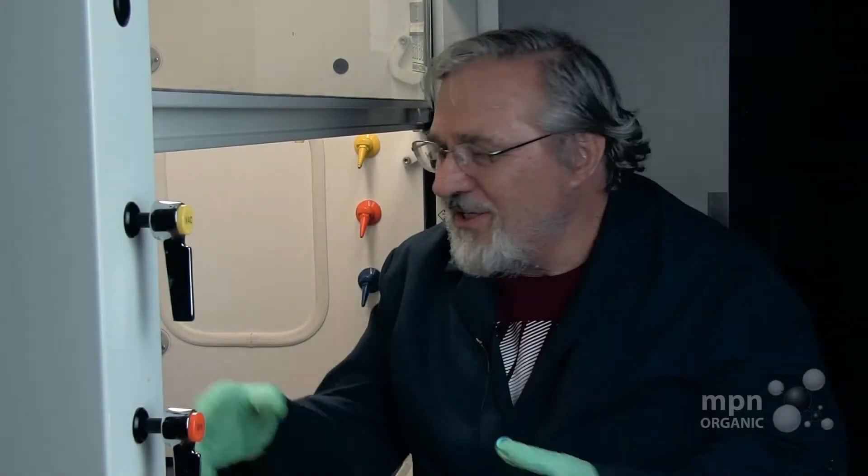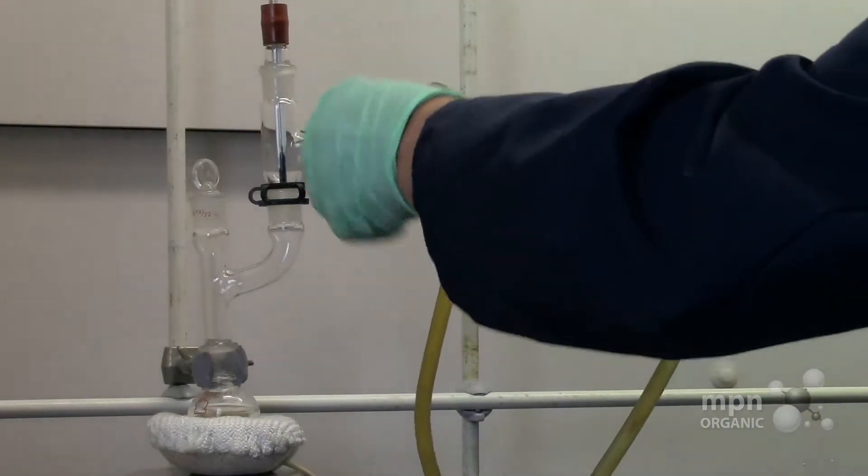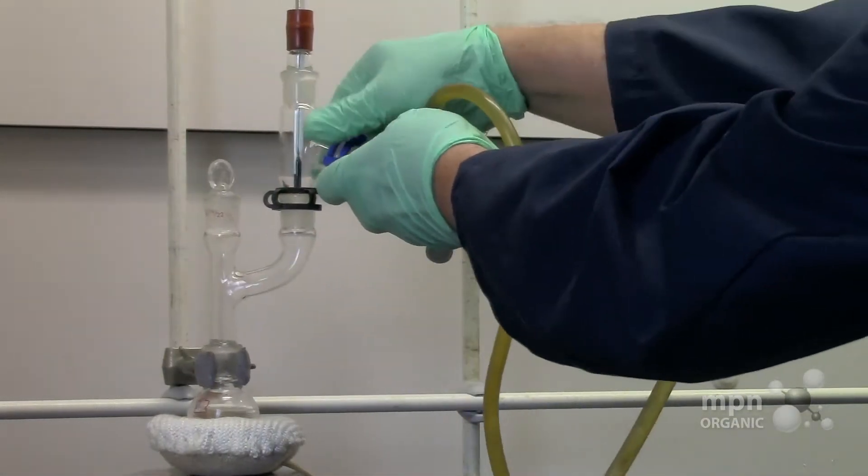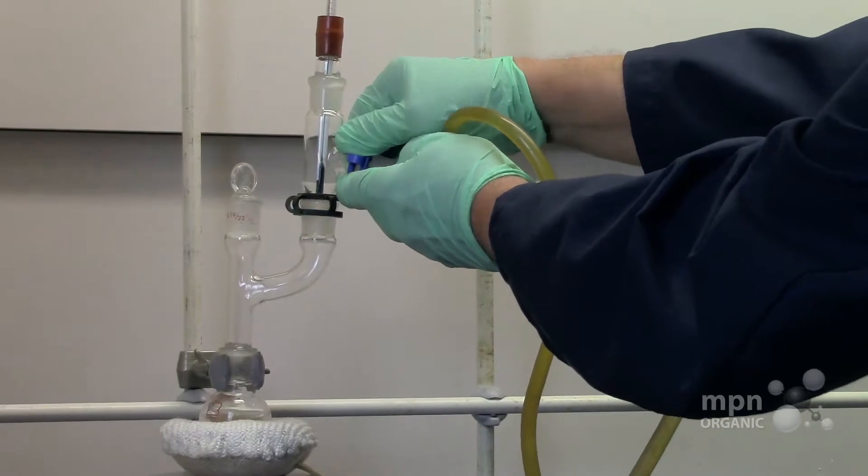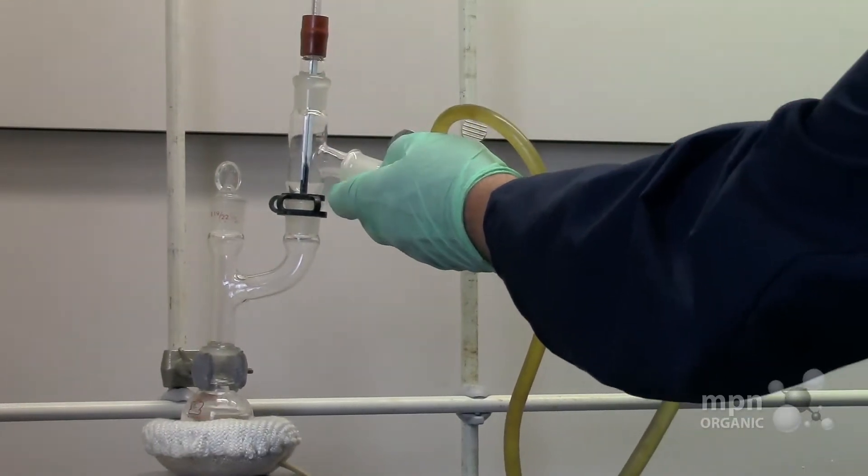As long as we are using the Claisen adapter, it just occurred to me that when you do your Grignard reaction a little bit later in the semester, you will be able to also use it in a reflux capacity.